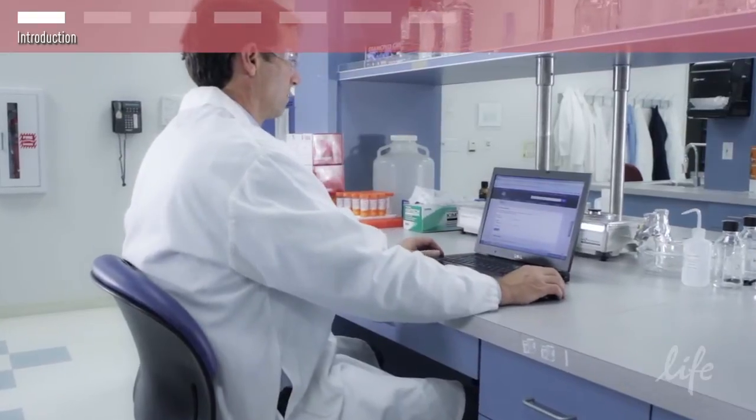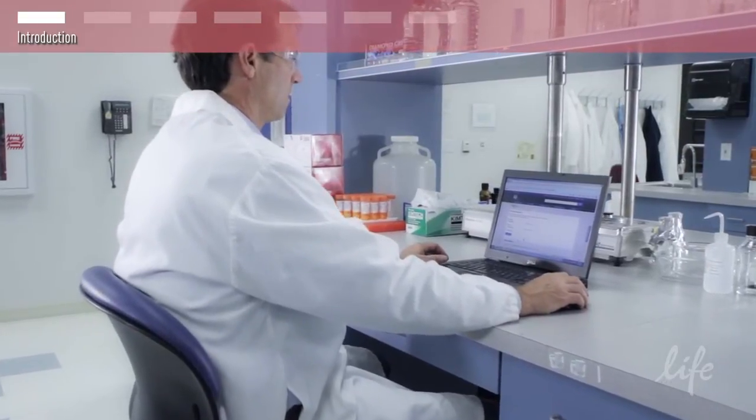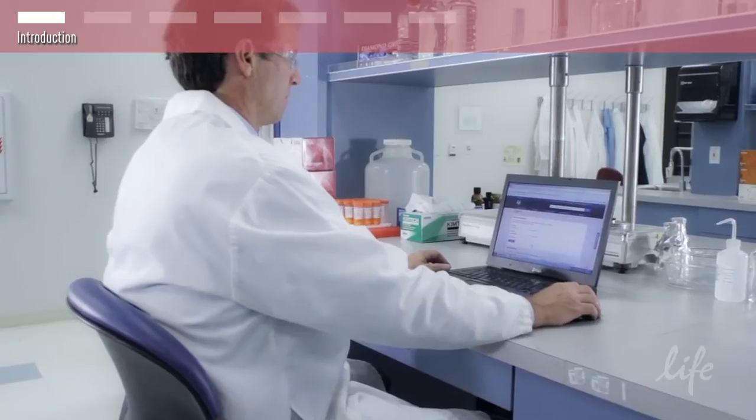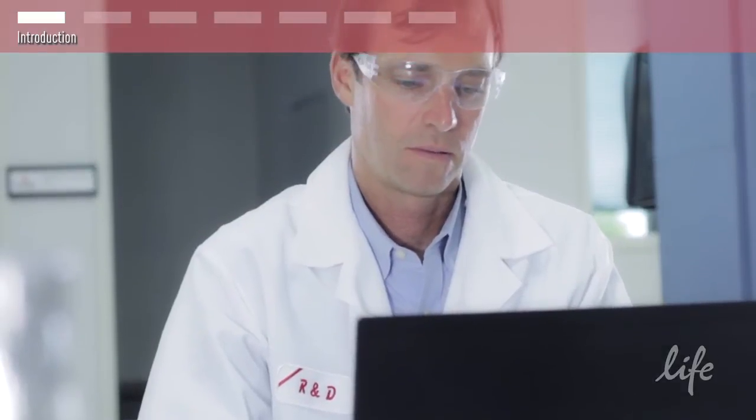Let us take you through the creation of a construct with the new GeneArt Seamless Plus cloning and assembly kit. This step-by-step video will show you how to assemble your construct with ease.